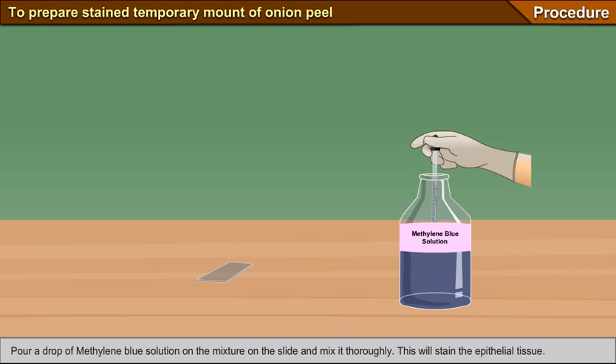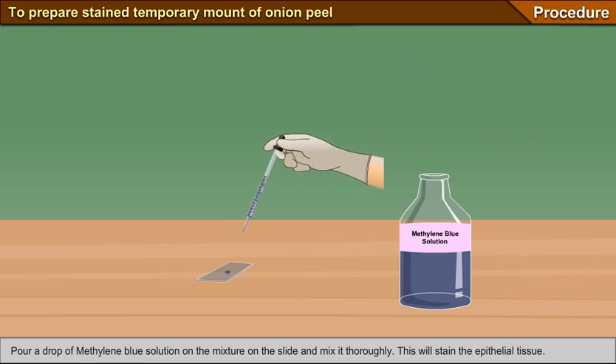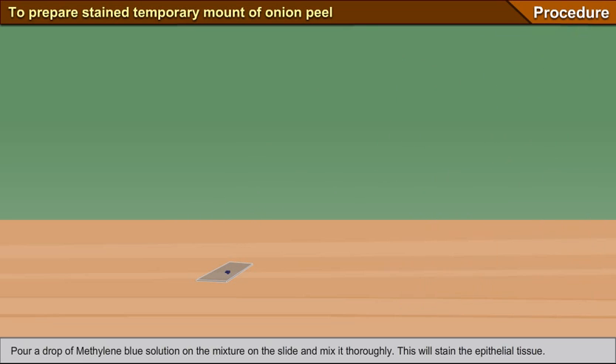Mix the scrape on the toothpick in the drop of water placed on the slide. Pour a drop of methylene blue solution on the mixture on the slide and mix it thoroughly. This will stain the epithelial tissue.